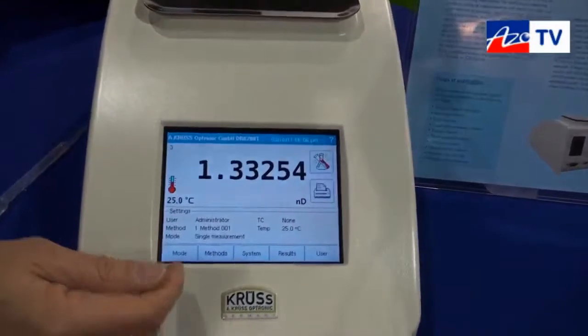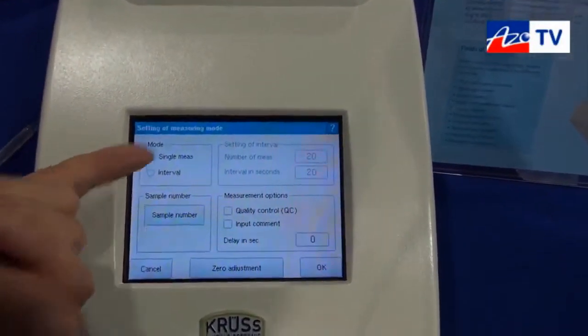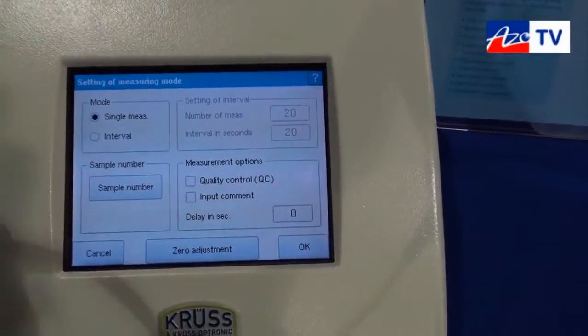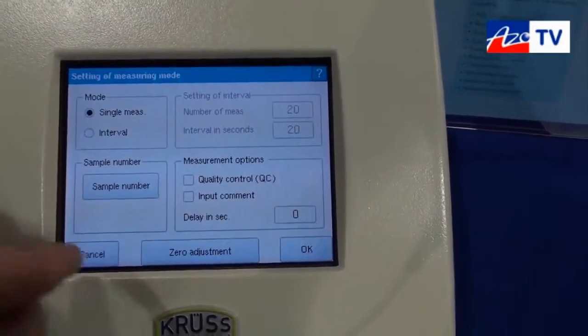You have different modes that you can configure, with interval measurements and single measurements. You can also enter information for a measurement directly on the screen.